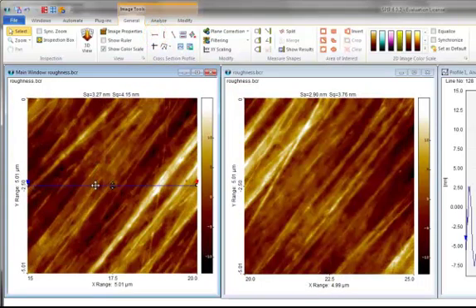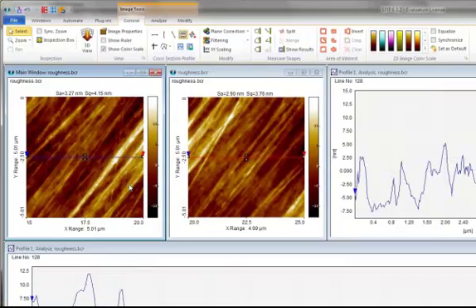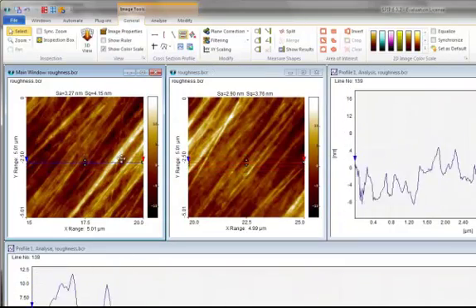Please note that you can use the Synchronize feature to synchronize your cross sections in all images.